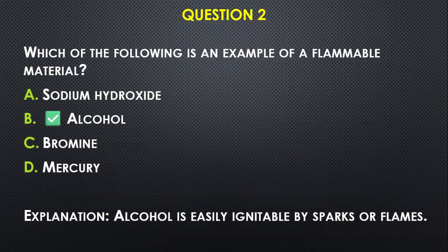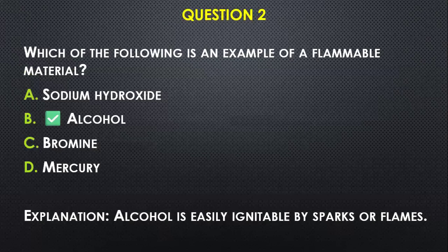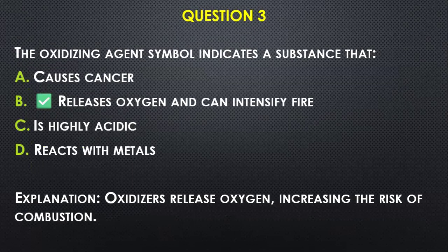Question number two: Which of the following is an example of a flammable material? A flammable material is something that can catch fire. Options: A) sodium hydroxide, B) alcohol, C) bromine, D) mercury. I would put alcohol because it easily catches fire whenever there are sparks or flames around.